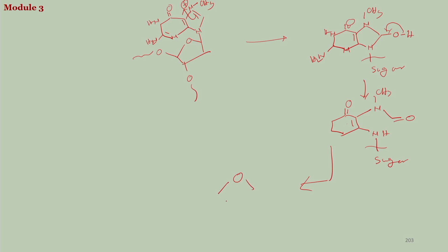So, basically what you get is this temporarily, your phosphate and the DNA. So, you get the sugar without the nucleobase, and this is called abasic sugar.